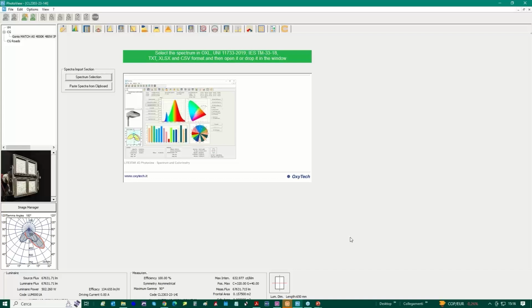So in this case, in place of having only 200 intensities, we have 200 by 400 values, if you have a spectroradiometer with a step of 1 nanometer. In this case, you come to a total of 80,000 values that you have to manage. So it's a huge set of information.